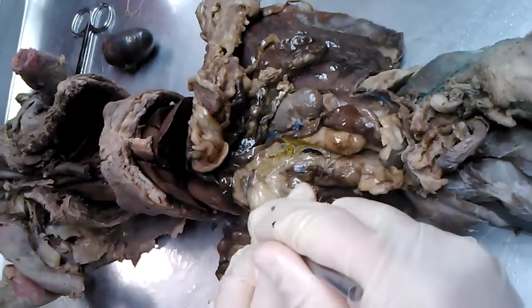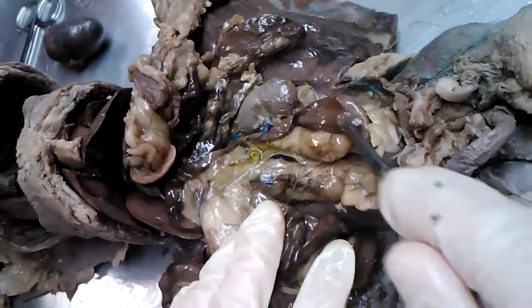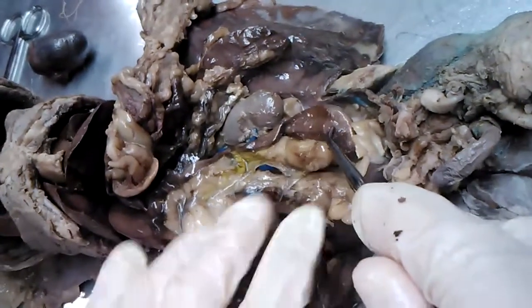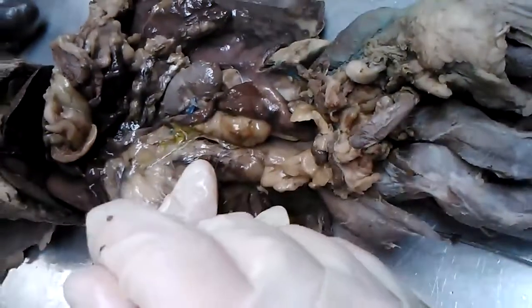Flip everything over to this side now. Here is the end of the ileum coming around like so. This point down where it gets wider, now we have the large intestine or colon. The most inferior part way down there is the rectum. So again, you get ileum, large intestine, and rectum.